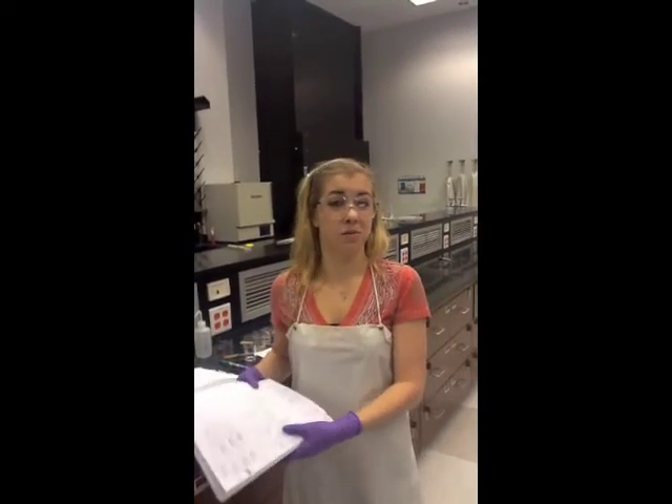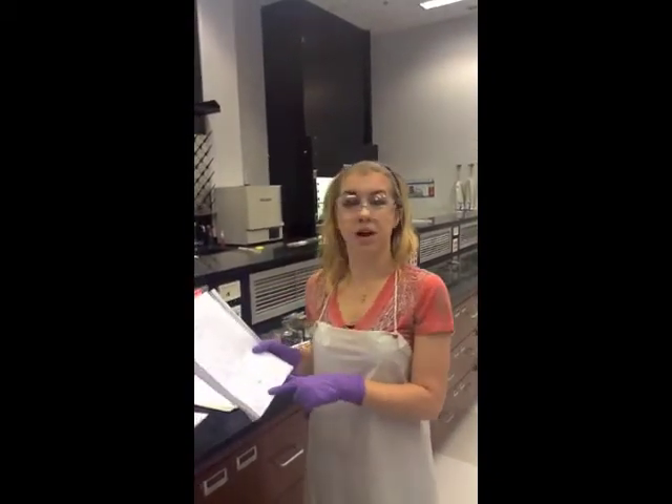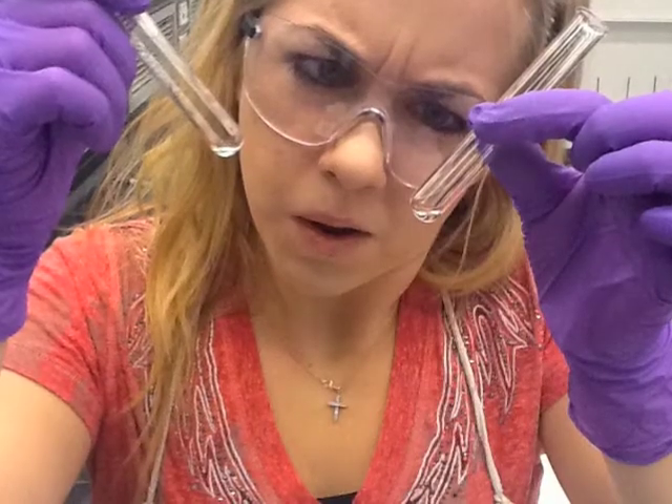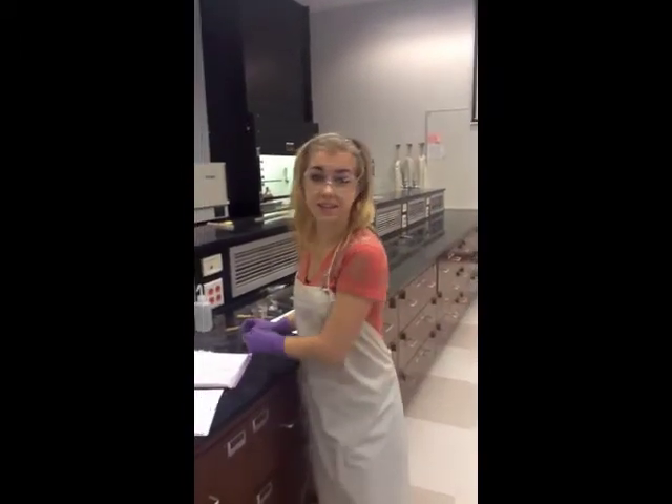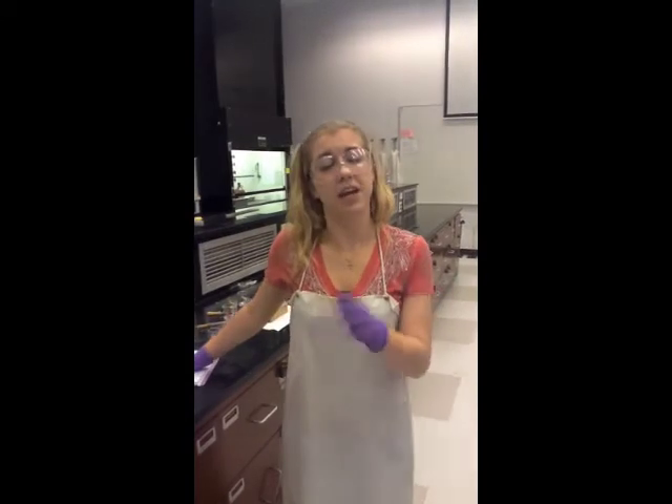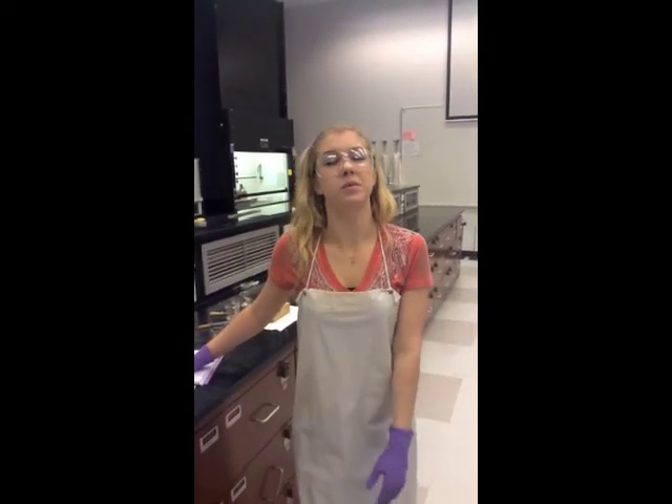This experiment is one of the most enjoyable, but also one that requires the most caution. Planning is key. In your student lab notebook, write what you are putting in every test tube in each trial and their results. If you do not plan, you will likely mix up the test tubes and what you are doing, which increases the chance that you will leave something out. A good idea is to plan beforehand what substances you want to combine. Before even walking into the lab, you should have a skeletal outline of what your procedure will look like. Once you are in the lab, you can add or change the skeletal outline, but ultimately it will help guide you along. It's like making a procedure list for yourself. This will also help when writing your discussion, because everything will already be organized and you will just have to report the results.